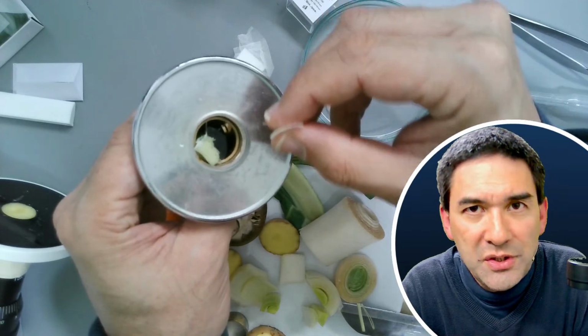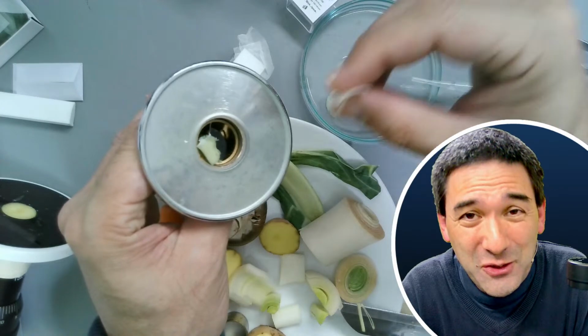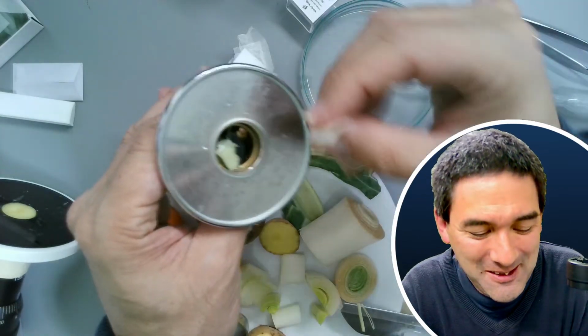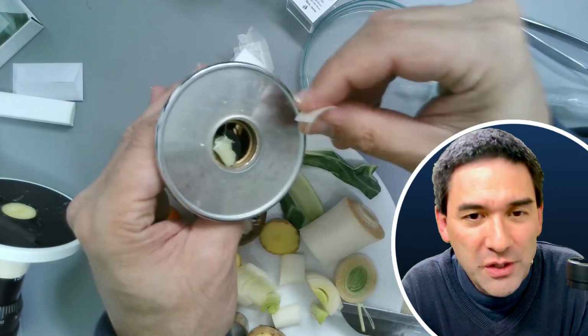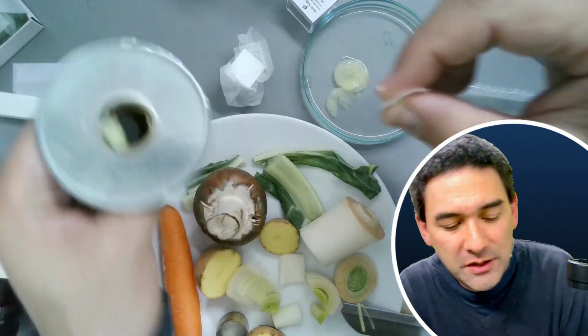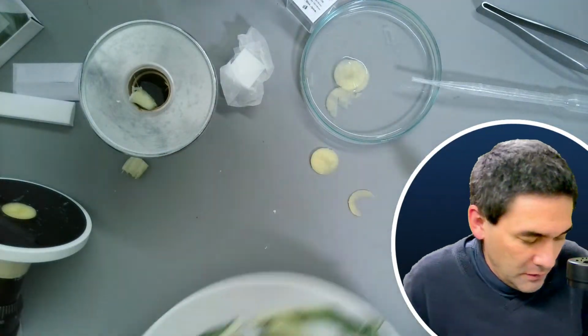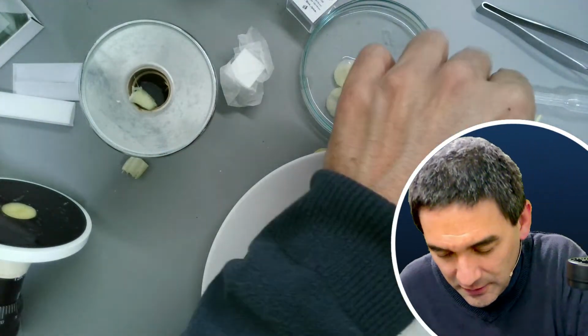So what you can do is you can use potato, or I prefer to use carrots, because the carrots don't have those starch grains that might contaminate the specimen. You can use a carrot as a holder for this, and that's what I'd like to show you. So again, let's put the vegetable soup away. Or actually I can't, because I need the carrot.